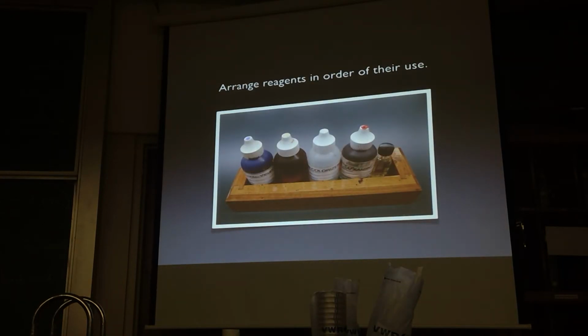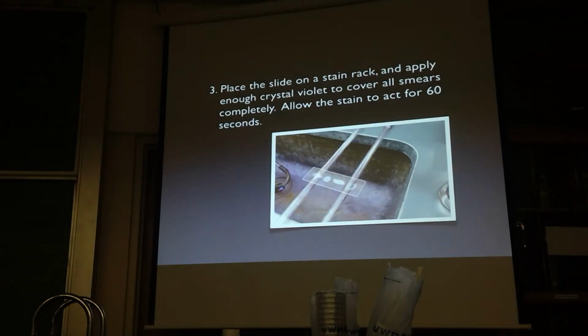Your reagents are in this order. They used to have marks on the tops of the caps, and that was supposed to help students not mix up the caps. Please don't mix up the caps. The colors didn't work. Telling you probably won't work either, but.